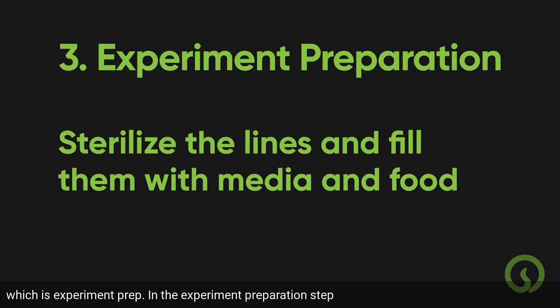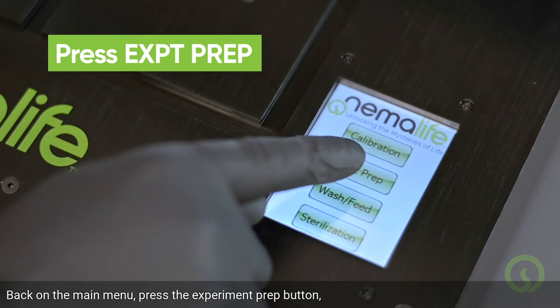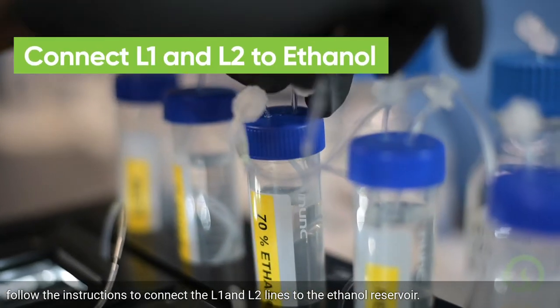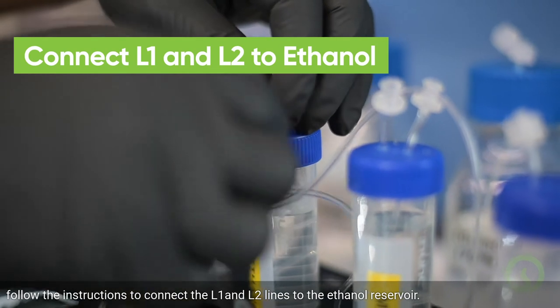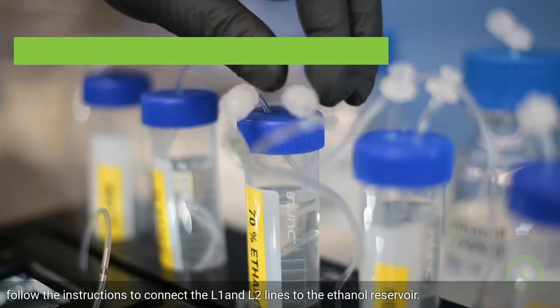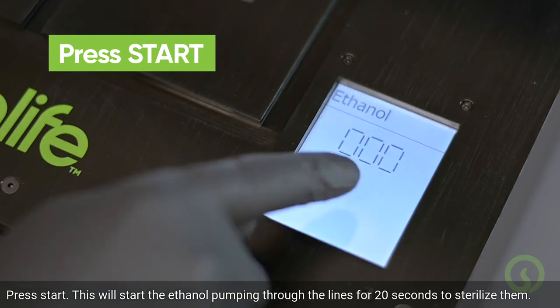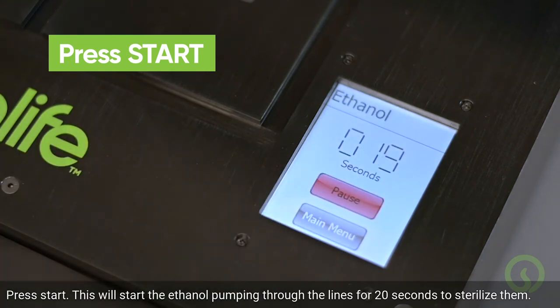In the experiment preparation step, you'll sterilize the lines and fill them with media and food. Back on the main menu, press the EXPERIMENT PREP button. Follow the instructions to connect the L1 and L2 lines to the ethanol reservoir and press START. This will start the ethanol pumping through the lines for 20 seconds to sterilize them.